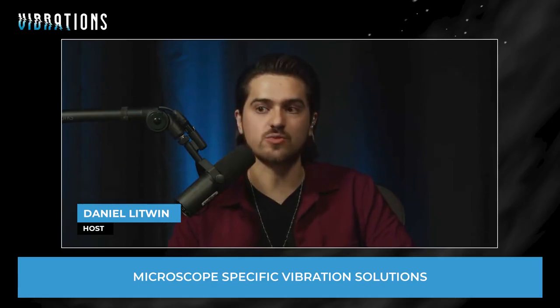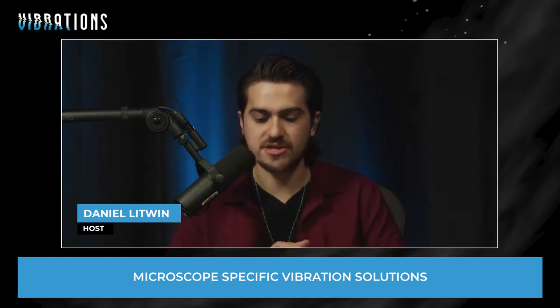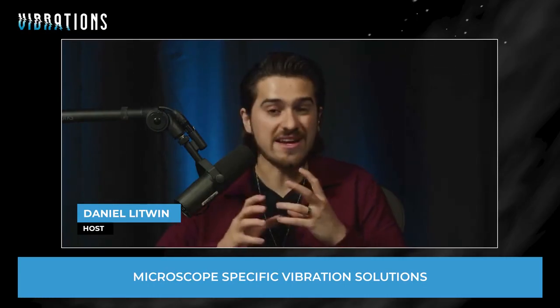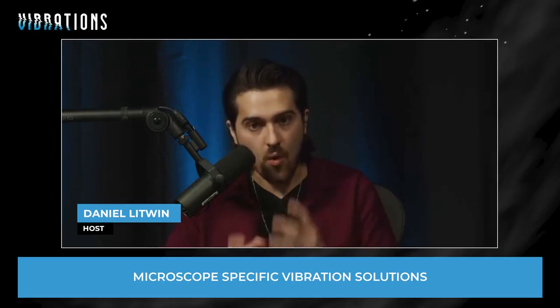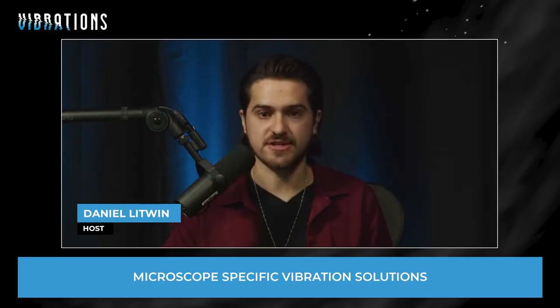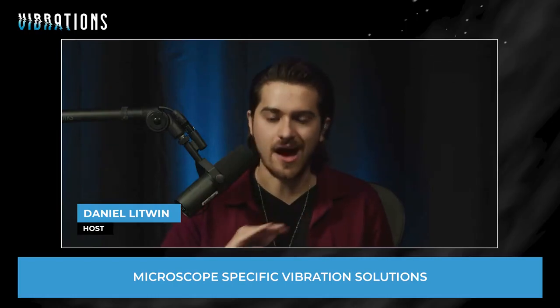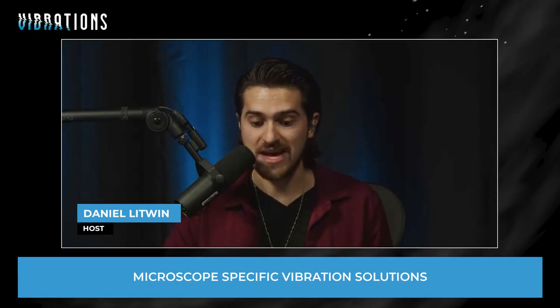And last but not least, we'll also give some time to discuss the difference between custom versus off-the-shelf solutions in this space. We'll cover ergonomic and practical considerations for vibration platforms, whether suppliers provide integrated solutions, and why addressing vibration issues early is critical for your facility's long-term success, right? Identifying this early, finding the right solution, and knocking that issue off the checklist. So let's get right to it.